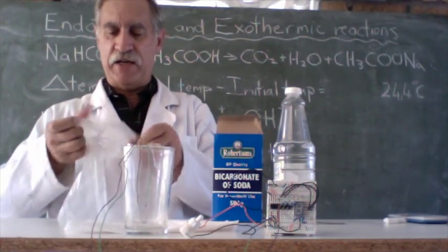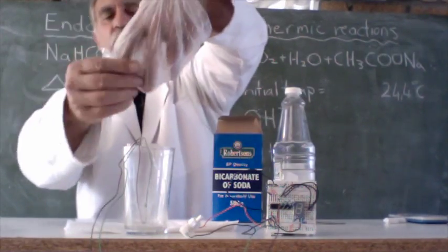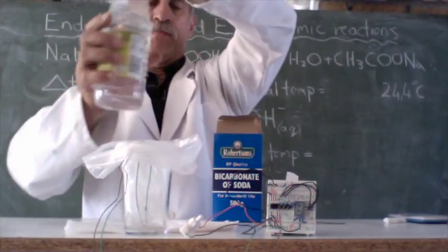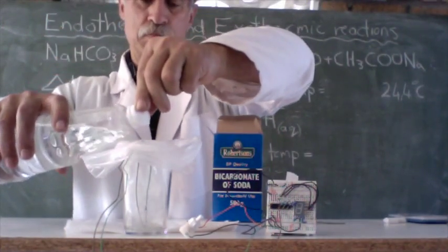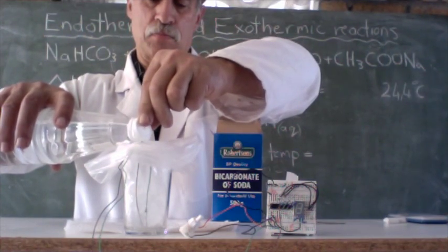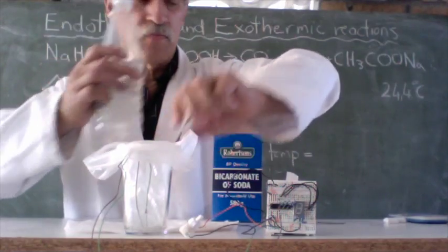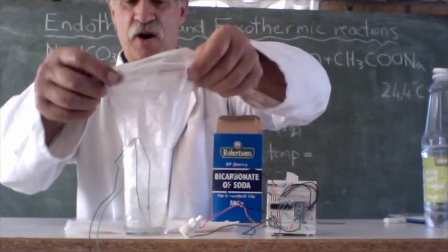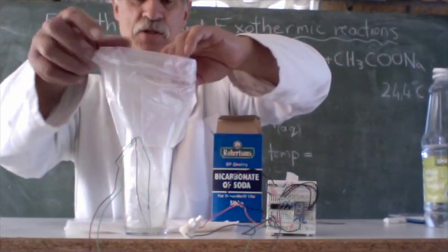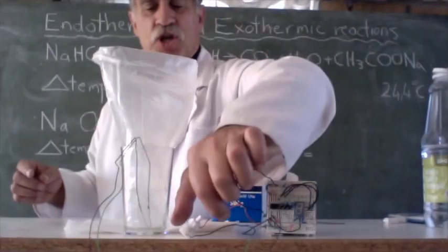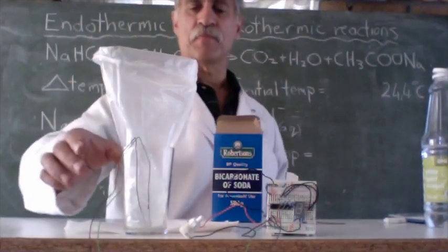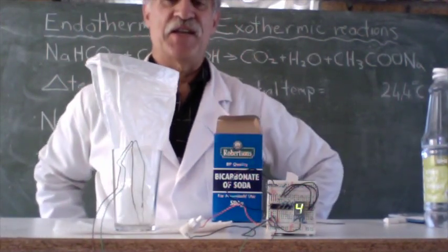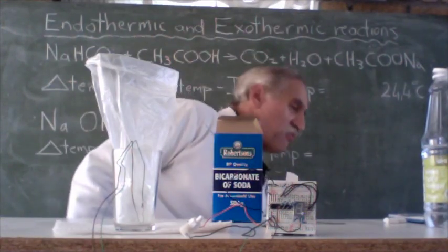We'll put our vinegar into the glass. So this is just to protect our little thermistor. Pour in some vinegar. So our glass is half empty or half full, depending on whether you're an optimist or a pessimist. Let's switch on our thermometer and it'll take a while to settle down.